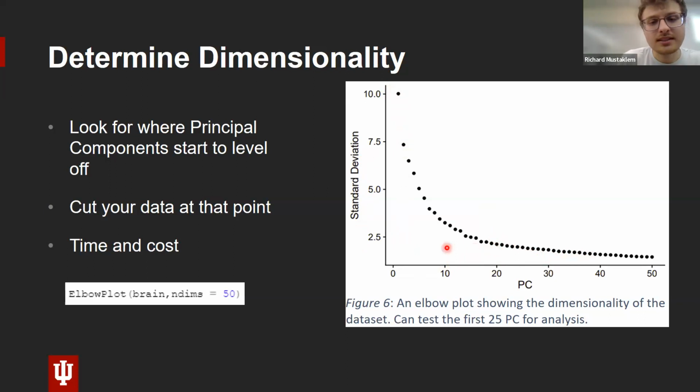So how we read this is you can cut it off. There's no one set way to determine where to cut it off, but computational biologists kind of agreed that as soon as you start getting a level slope of 0, that's when you want to basically cut your PC off. So that's why I cut mine off at around 25.